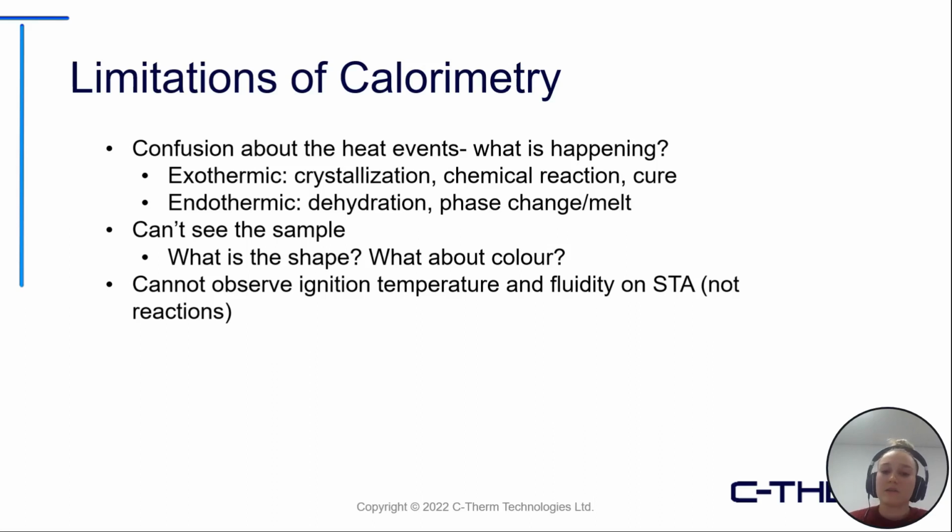Another thing that is of concern is you can't really observe the ignition temperature and the fluidity on STA. So, if you keep that in the back of your mind, we're going to go back to that later in this presentation. I'll show a really great example of observing the ignition temperature there.